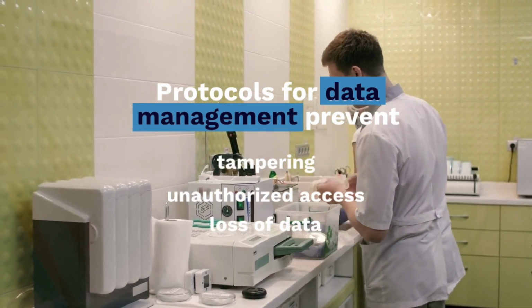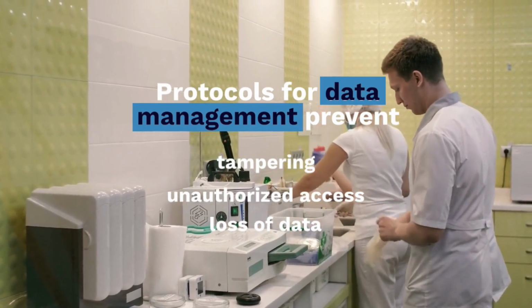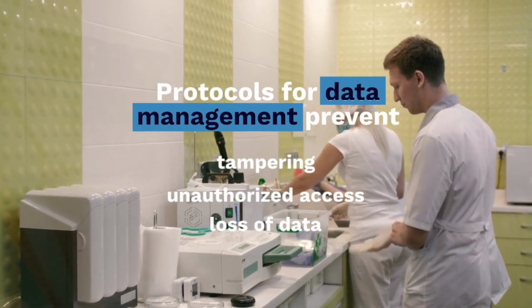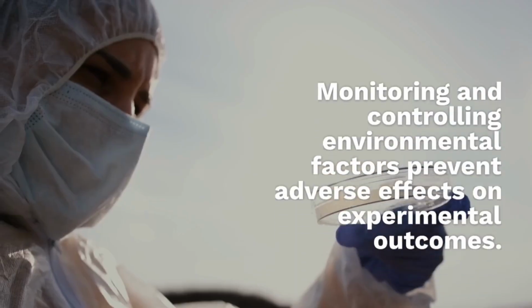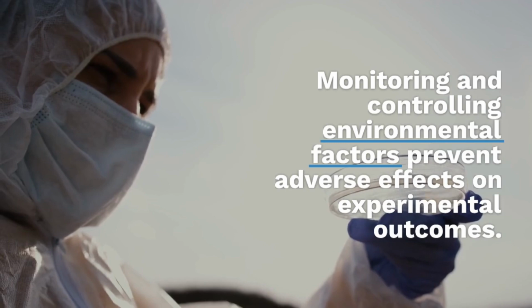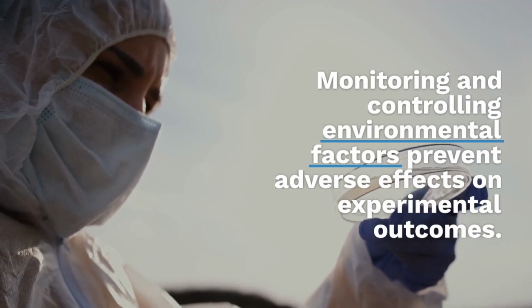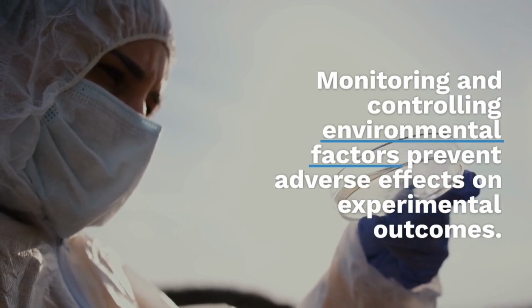7. Data integrity and management. Data integrity is crucial for maintaining the credibility of scientific research. Laboratories should establish protocols for data management, including data entry, storage, backup, and retrieval. Measures should be in place to prevent data tampering, unauthorized access, and loss of data.